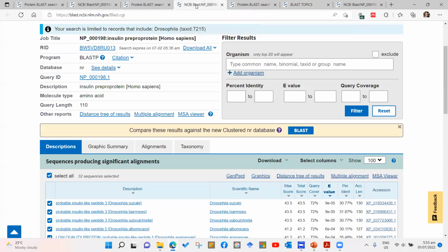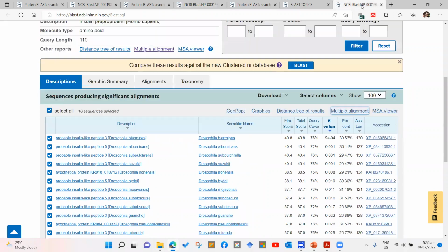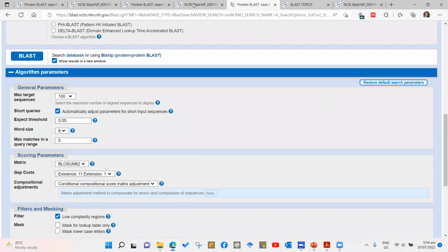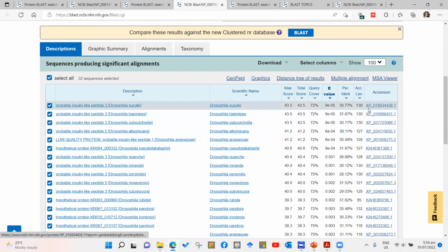What would be the possible result? So here is the result with no adjustment. You would see here your e-value is much lower compared to this one, E-4 to E-5. So there's a difference in the calculation because the scores are not adjusted. So the default for every sequence, regardless of the length. So you have this lower expect value.